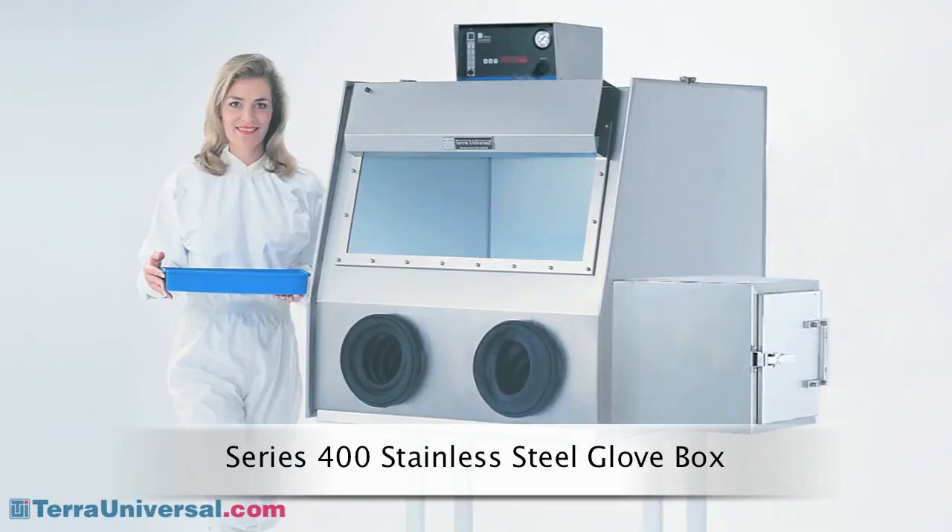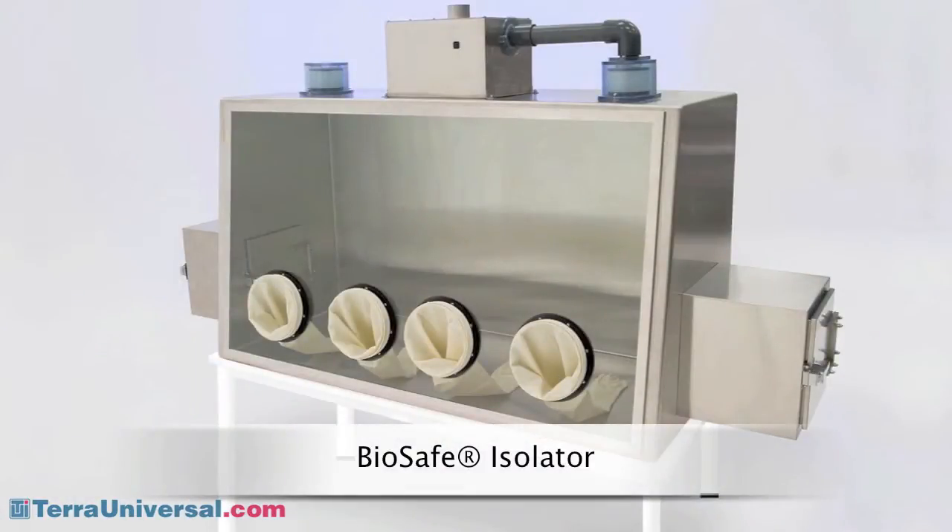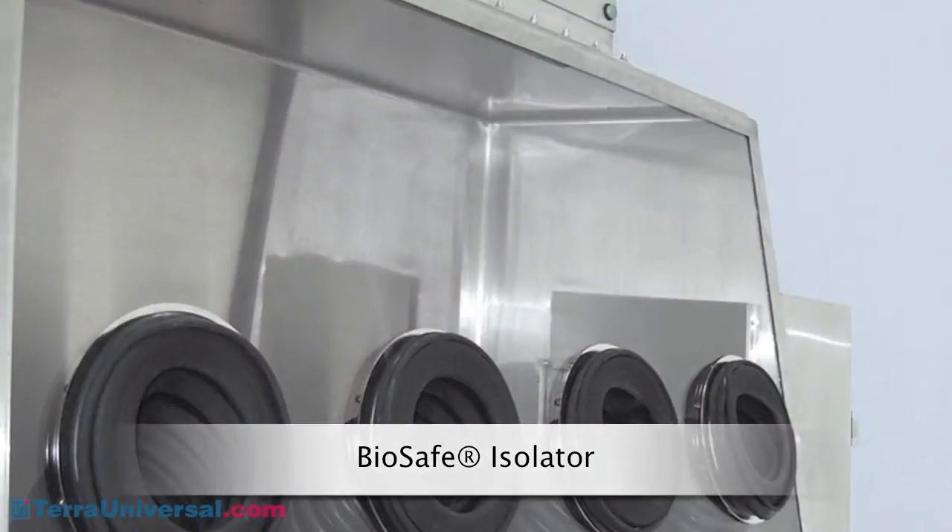For optimal moisture barrier protection and chemical resistance, select 304 or 316 stainless steel. These enclosures can be electropolished to remove surface impurities and create ultra-smooth chromium-rich surfaces that are easy to clean and sterilize. Tera's BioSafe designs optimize aseptic processes through the use of continuous seam welds and radius corners that eliminate cracks that can harbor germs.